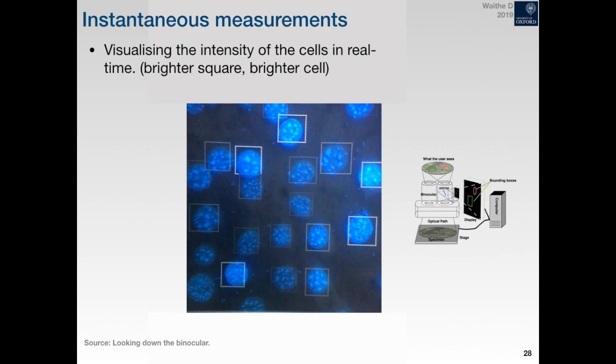There are limits to that, of course, but you could easily go between two different systems, which were wide field, and it still worked pretty well. I don't really know the extent of the range, but you could go from 100 times to 63 times. It depends where you train it.